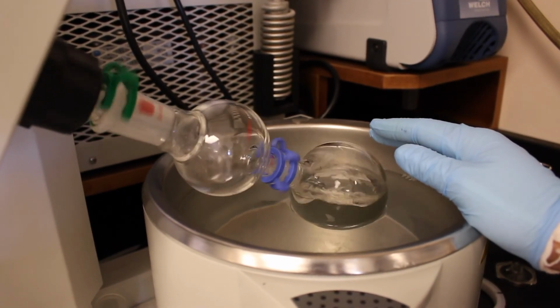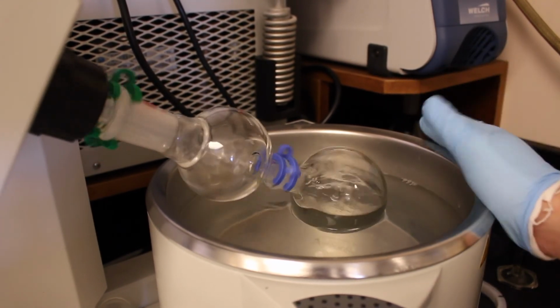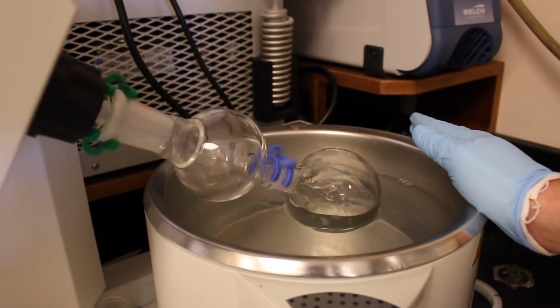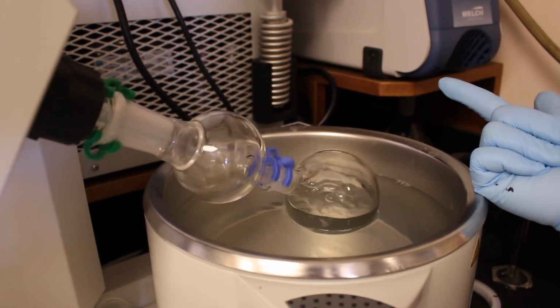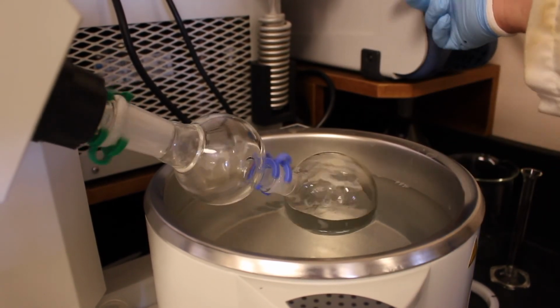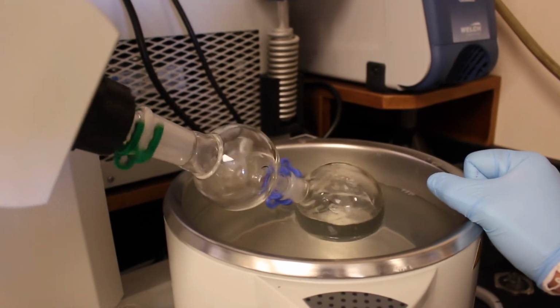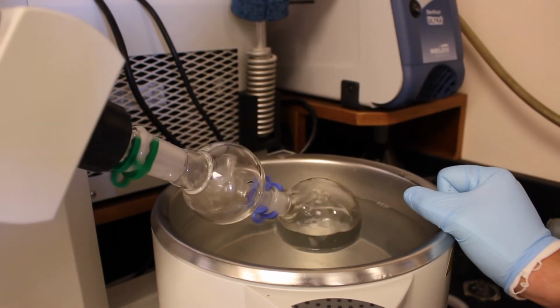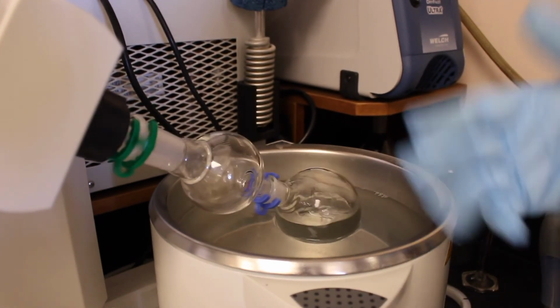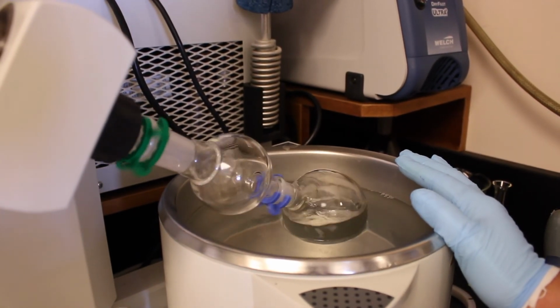So if you remember from our first lab when we talked about boiling, boiling is when a liquid's vapor pressure equals the atmospheric pressure. So the two different ways of getting a liquid to boil is to either increase its internal temperature, or you can decrease the external pressure, and that's what this apparatus does. So we decrease the external pressure almost to a full vacuum if you wanted to, so we can remove these solvents at low temperatures. And that's good because especially when you have temperature sensitive compounds, you want to remove them at a low enough temperature so as not to destroy your compound. So this will be over in a few minutes.